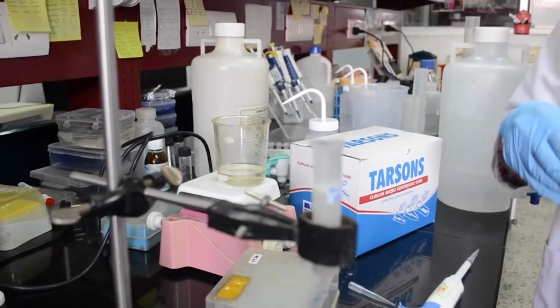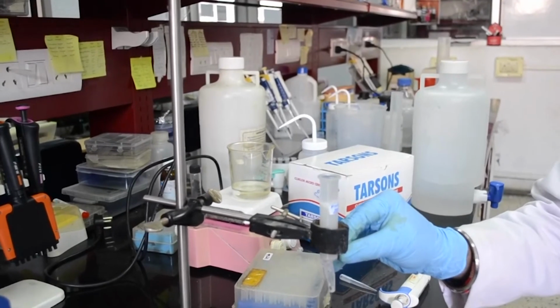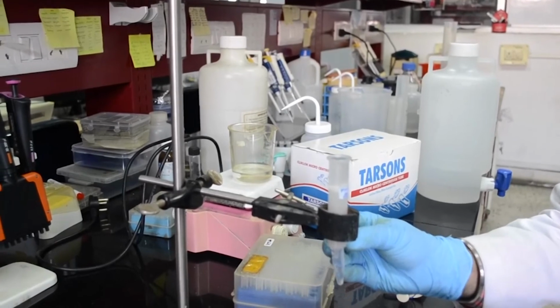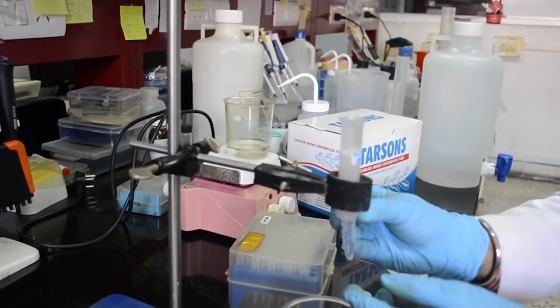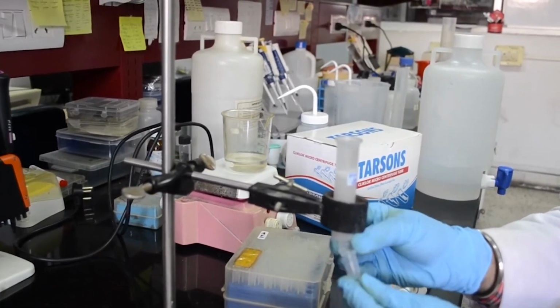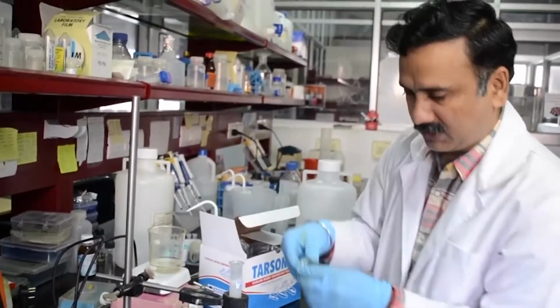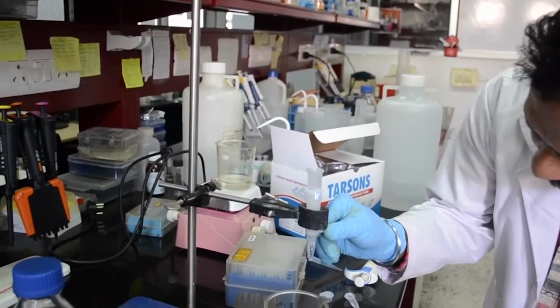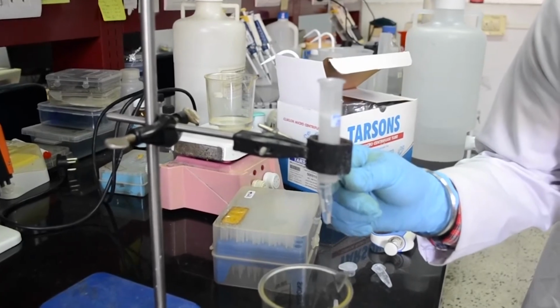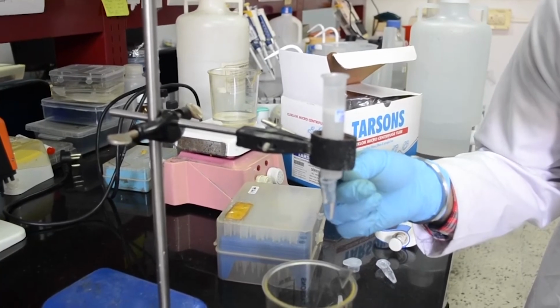What you can do is simply collect 0.5 ml fractions, and your protein will come out into these 0.5 ml fractions. You can collect 6 fractions of 0.5 ml each. I have collected fraction number 2, and in a similar way you can collect the other 4 fractions.